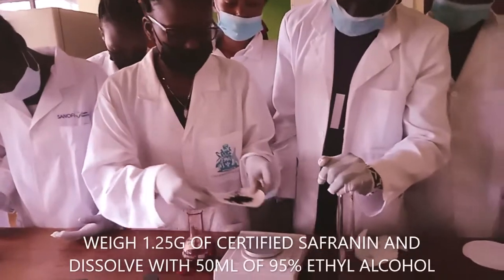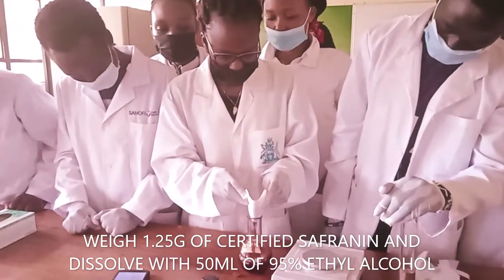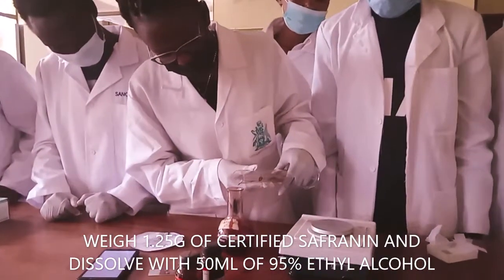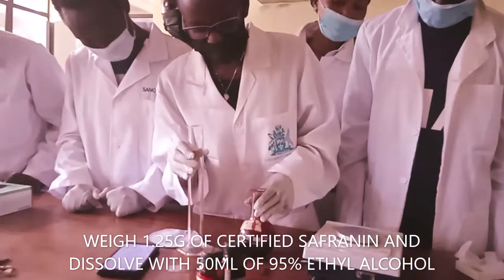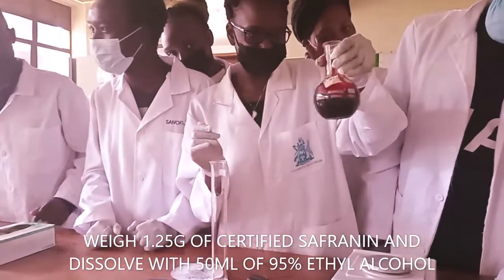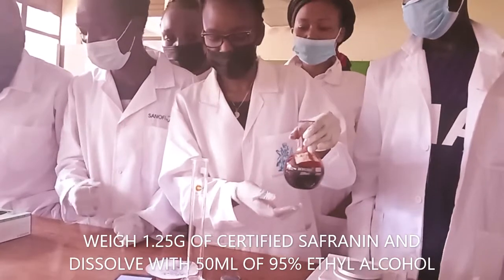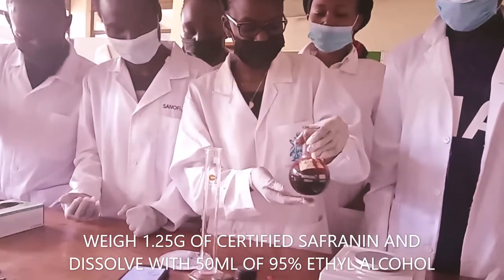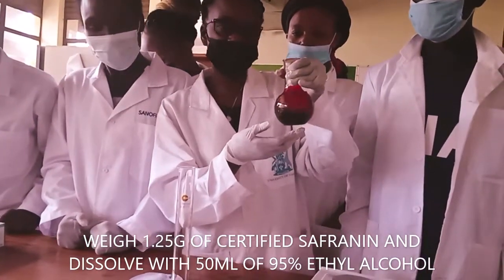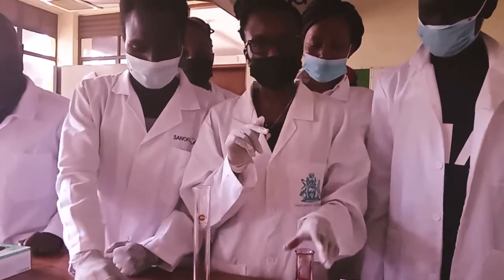This is the solution of certified safranin with 45 milliliters of ethanol. So this is the safranin solution. You mix gently. So this is a solution of safranin with ethanol.